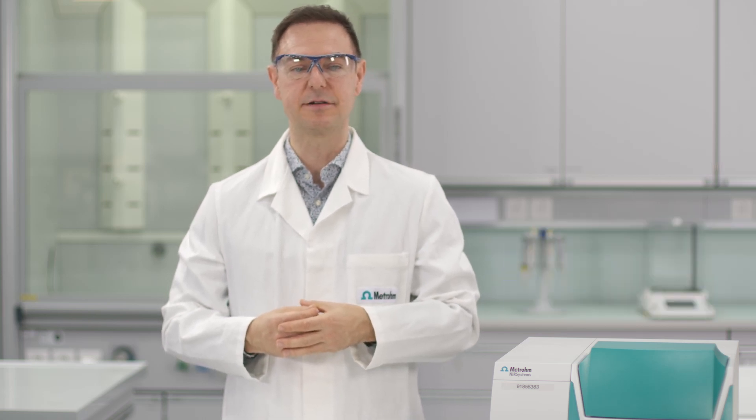Do you want to analyze key quality parameters of palm oil in less than one minute? Hello, I'm Dave, and in this video I'll show you how to do this with the DS2500 liquid analyzer from Metrohm.